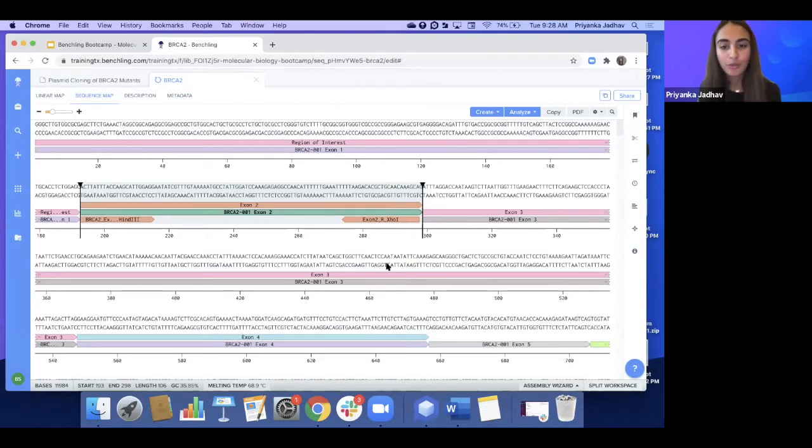Okay, so now everyone should be able to see the poll results. So it seems like the majority of everybody here currently annotates either A, on an individual researcher basis, or B, sharing annotations across teams and projects. So just to kind of go back into the Benchling platform.